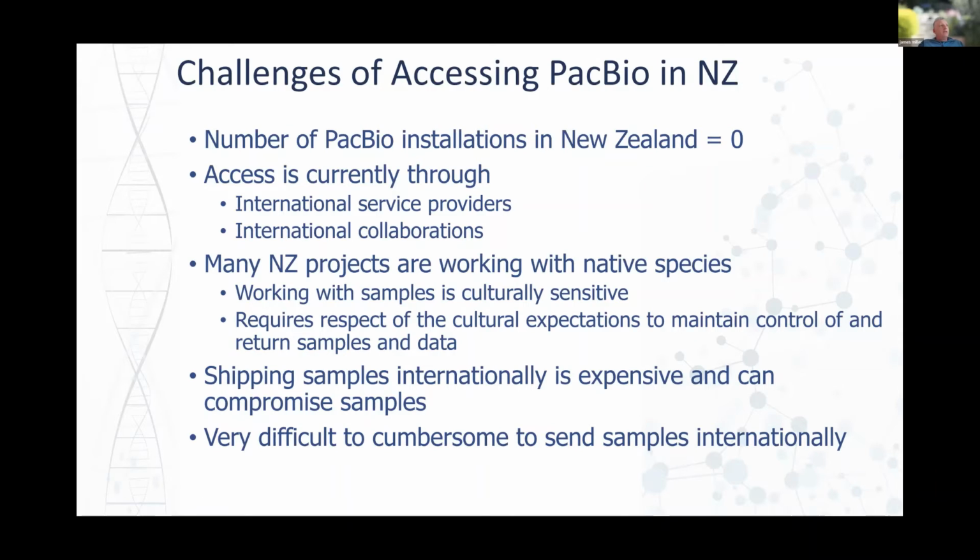For those that haven't, often they just default to accessible technology such as Oxford Nanopore, and they compromise. But I would argue that because PacBio HiFi is so good and such a game-changing technology, we really should be thinking about doing some of this in New Zealand.